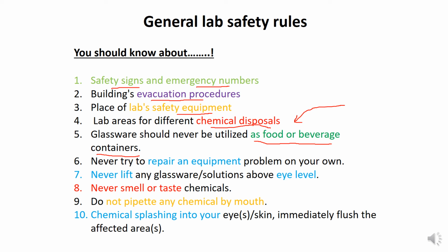This is also a very important rule for safety. Never try to repair any equipment. If there is any problem with the equipment, do not try to fix it because you are not the expert; just report it for repair. Never lift any glassware or any solution above eye level. So this is really very important.